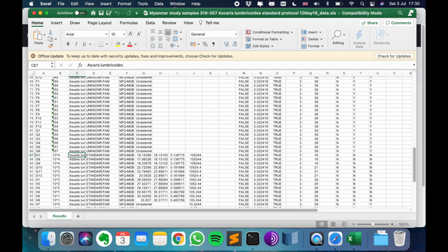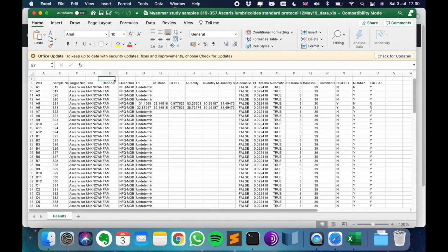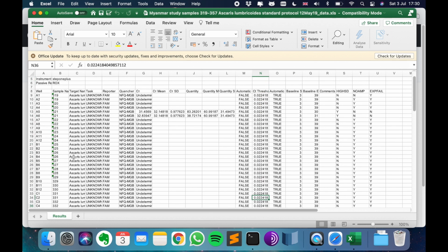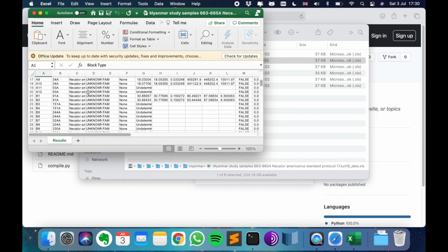The purpose of this script is to pull the quantitative columns along with the sample number and Cq values, both replicates for every sample, from all individual Excel files you save and export after every qPCR run with standard curve in your machine. Ultimately, this script will combine them into a single file, ready for further analysis using R, a tool frequently used in epidemiological studies.